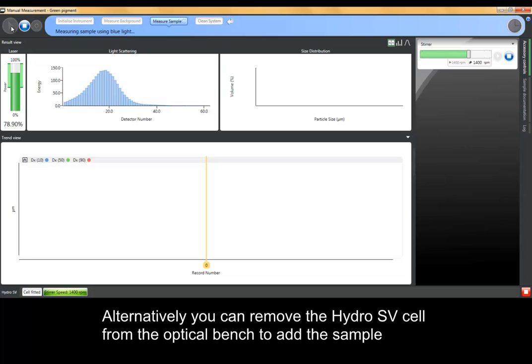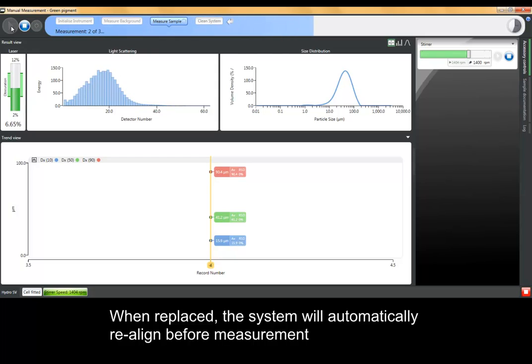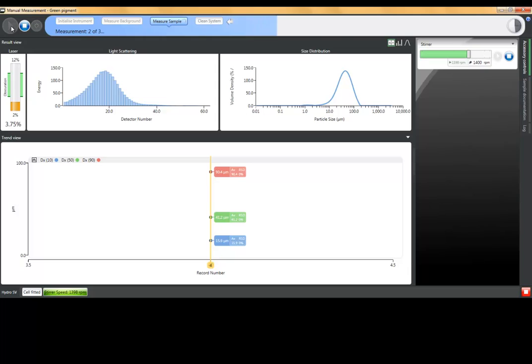As an alternative to the pipette access, you can remove the Hydro SV cell from the optical bench to add your sample. Then when the cell is replaced, the system will automatically realign before starting the measurement.